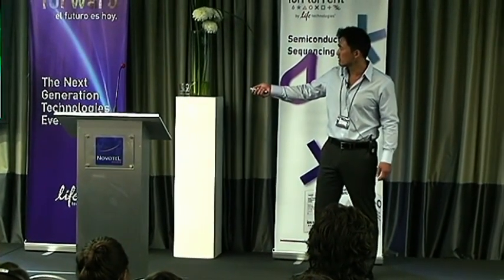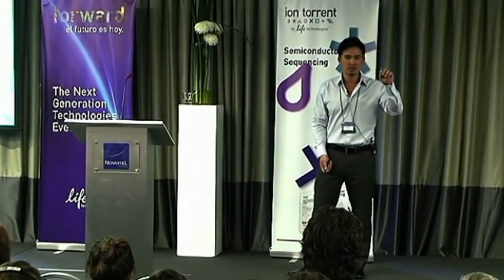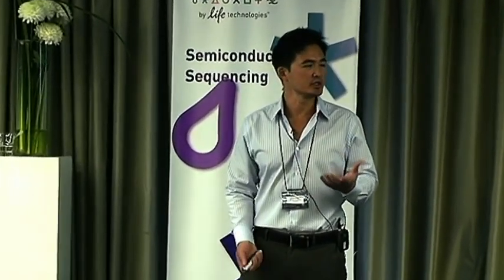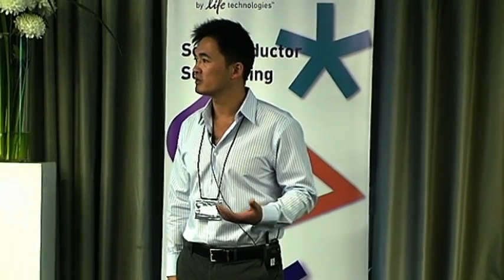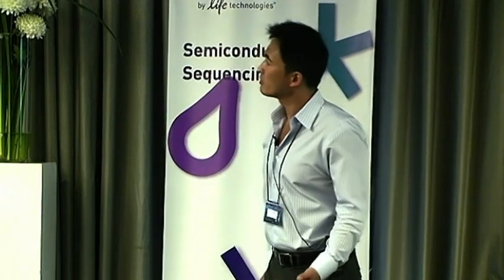What I'm showing you here, in these two images, is, remember I said for genotyping, you could actually spot multiple samples per subarray. So what happens then is the instrument would just discard the pipette tips. It will go back and grab more pipette tips, go into different sample wells, and then come back in and just reload the other half of the subarray. So that way, instead of just having 48 samples on an array, now all of a sudden you're looking at 96 samples per array. If you're going through this format right here, then basically you can look at as many as 144 samples. So the loading is very simple.